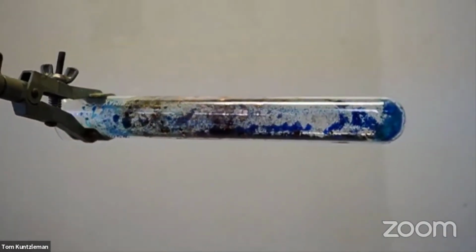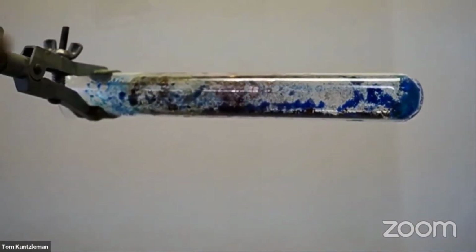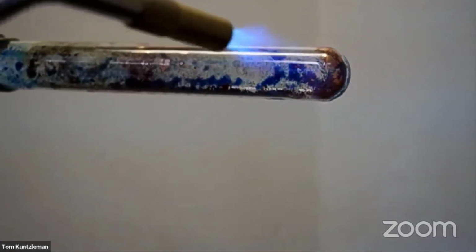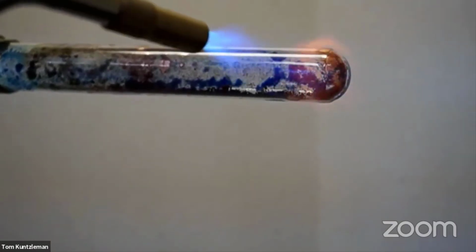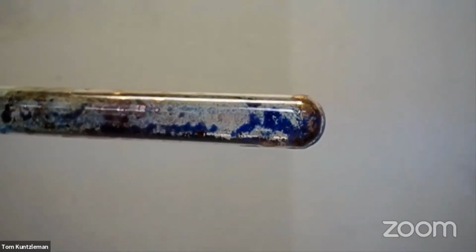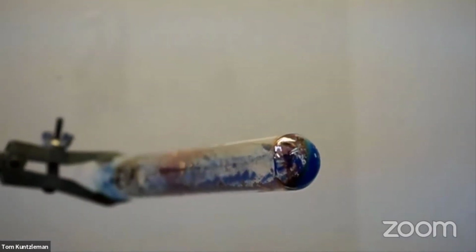Looks like a shiny orange metal, I think. Look at that. Oh, that's so beautiful. I think by heating this compound that has copper-2 in it, the chemistry of this thing did, I was able to form some copper metal. You can see that nice shiny mirror there.